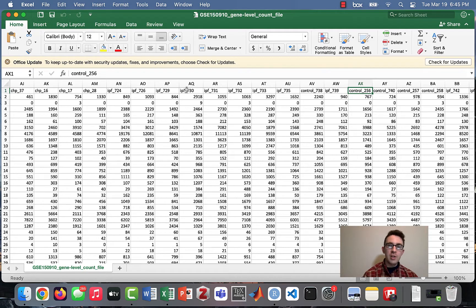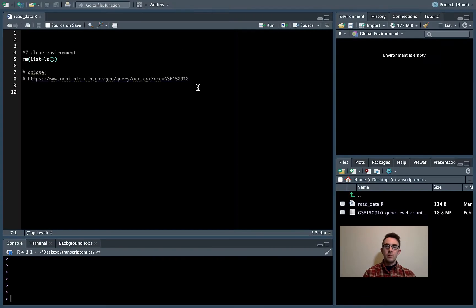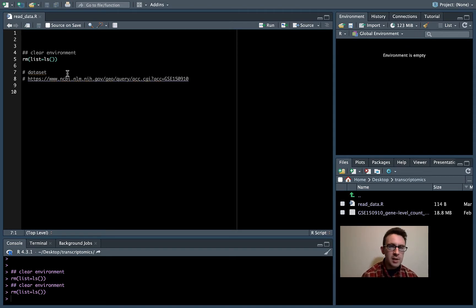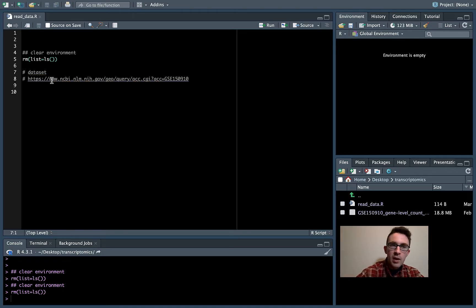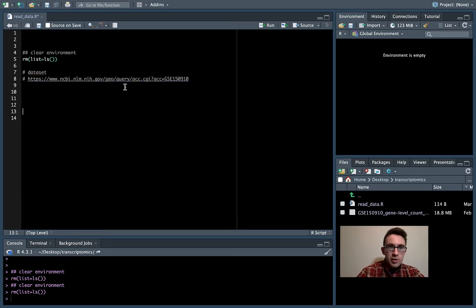In this lesson I'm going to show you how to actually read this dataset into R so we can start working with it. I put the data file and an R script called 'read_data.R' in the same folder. I like to start all my R scripts with a command to clear the environment. It's also good practice to put a comment with a link to where the dataset came from, so I've included a link to this dataset on the GEO website.